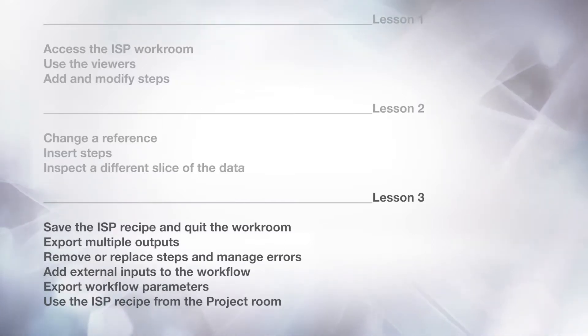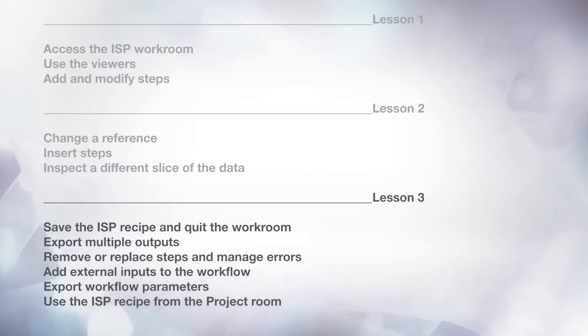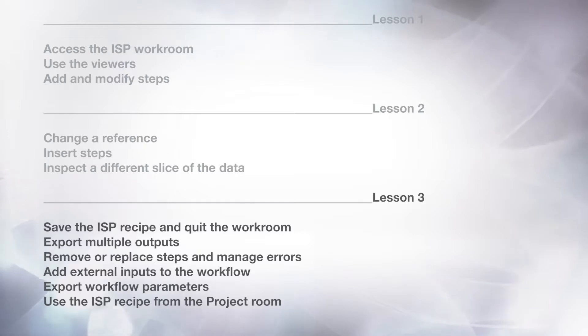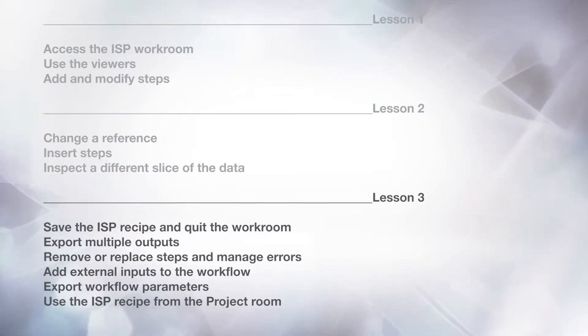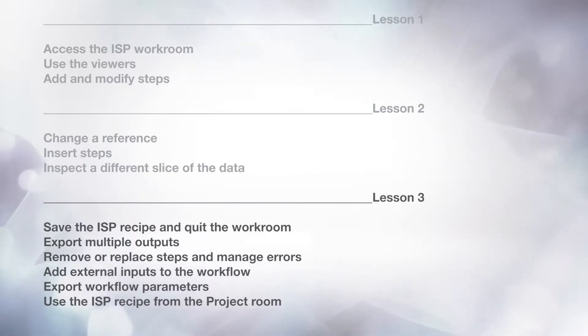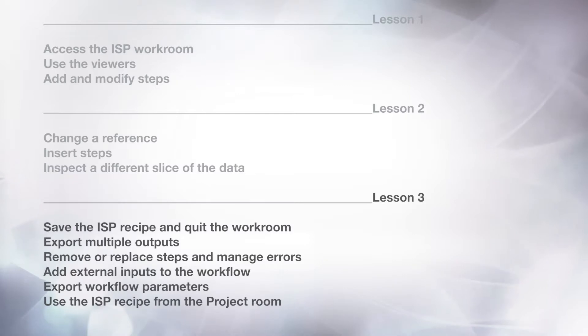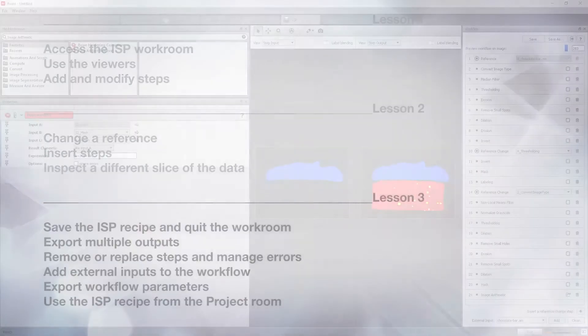In this last lesson, you will see how to save the image stack processing recipe and quit the workroom, export multiple outputs, remove or replace steps and manage errors, add external input to the workflow, export workflow parameters for easy access from the image stack processing module, and use the image stack processing recipe from the project workroom.